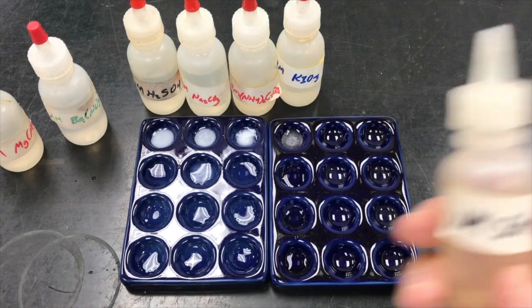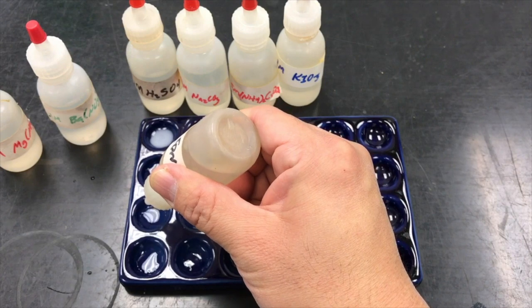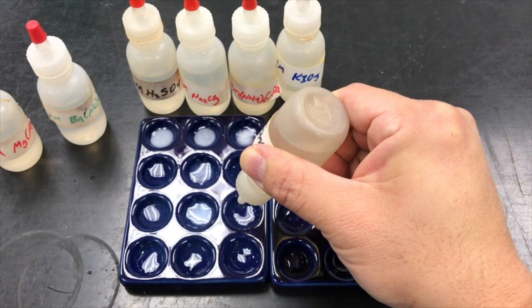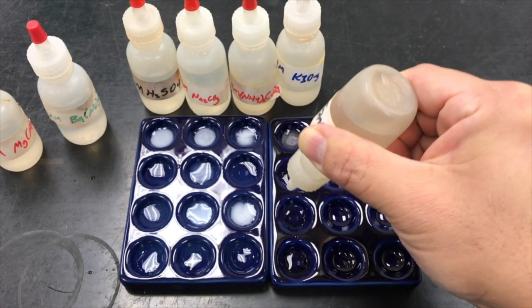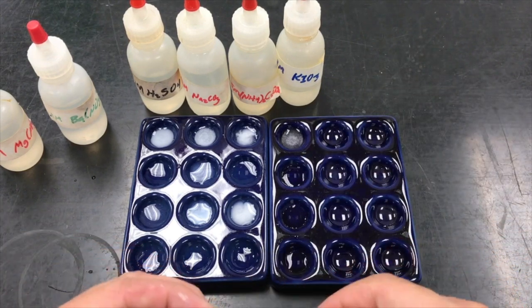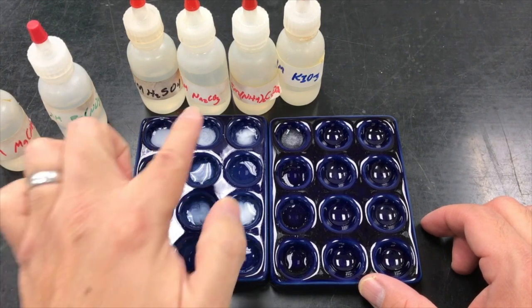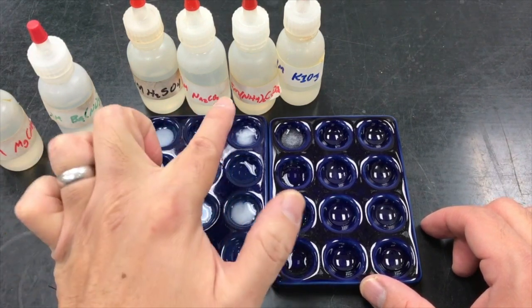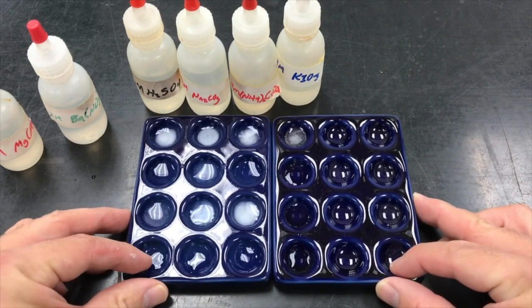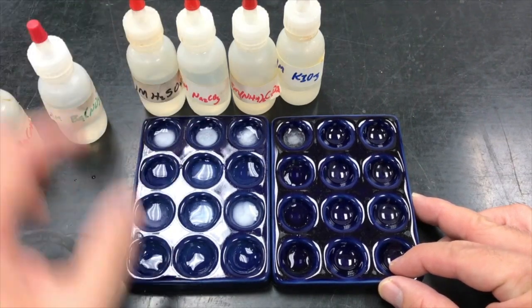The third row, we'll use the strontium. And it looks like our precipitates between strontium are with the carbonate and the ammonium oxalate. We have some late-onset precipitation with sulfuric acid, to a lesser degree, but still there's some precipitation there.